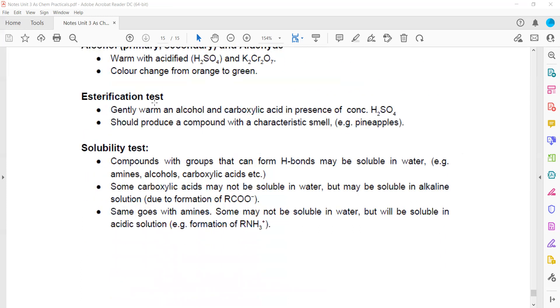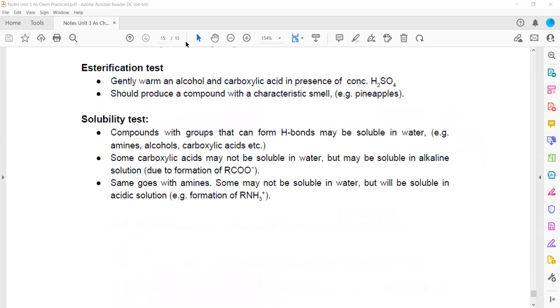The esterification test involves gently warming an alcohol and carboxylic acid in the presence of sulfuric acid. This produces an ester with a characteristic fruity smell — for example, a pineapple-like smell — confirming that the esterification reaction has occurred.